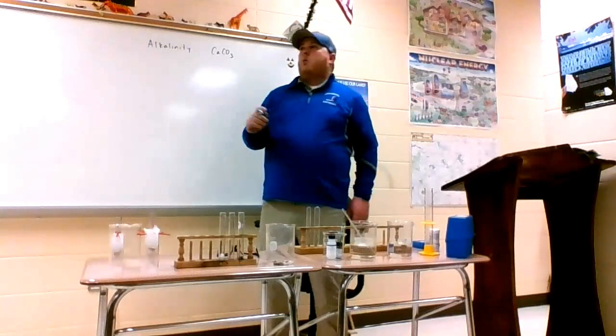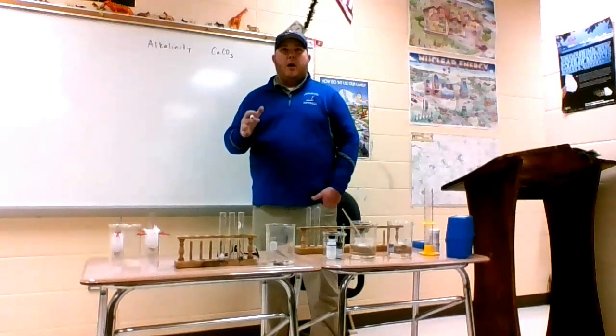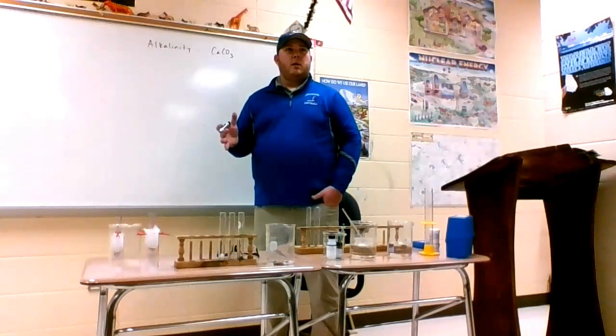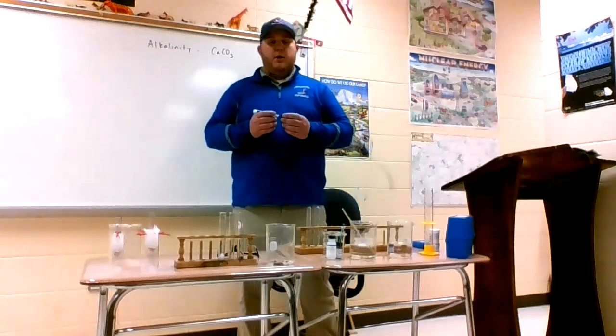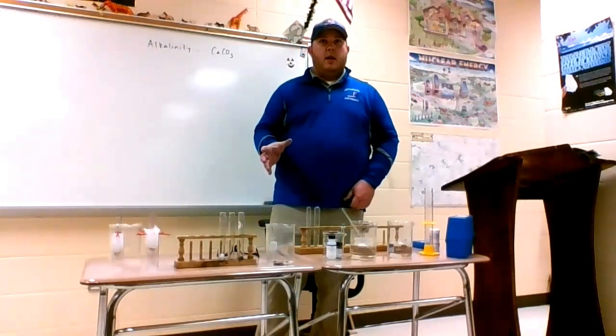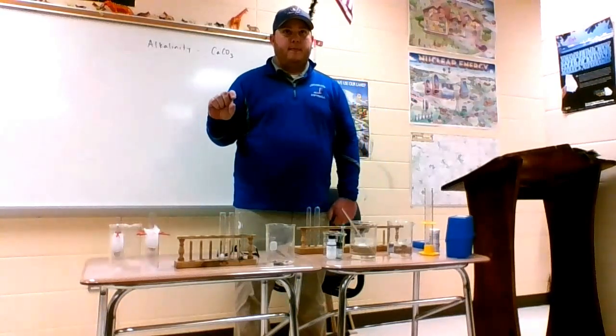What it measures is how easy or how hard it is to change the pH of a given sample of water. So let's say that I had neutral water from the tap. pH is 7. And I go and I add some sulfuric acid.